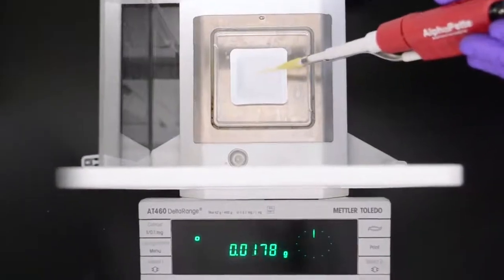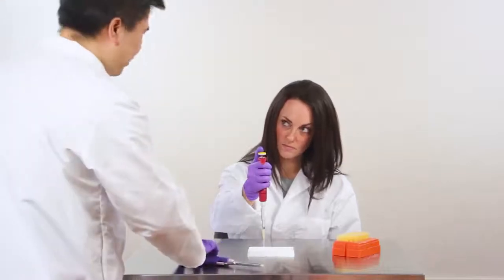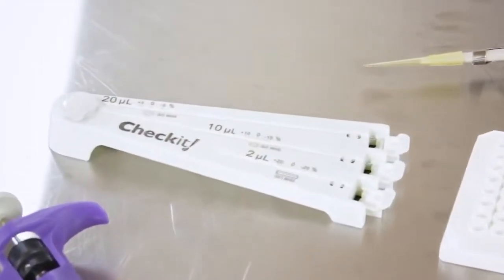No more trying to read a tiny droplet's weight on a high-precision balance, or wondering where the heck your pipette has been. Whenever you need a fast quantitative assessment of a pipette's accuracy, just pull out a Check-It. It's instant, easy verification anywhere.